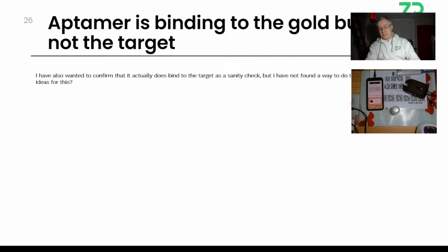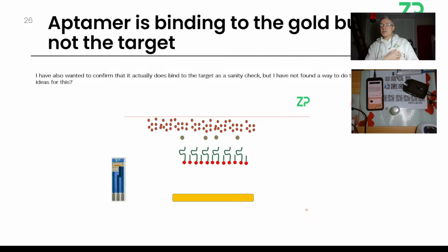It's the same way you're not going to see it by that ferricyanide. At least with the ferricyanide experiment, you could try it. But I'm not holding up a lot of hope. I suppose it's a tricky one. It's almost like if there's somebody in the lab doing another aptamer assay, and you're not able to follow the aptamer assay out of the literature, it could be the literature that's actually not reporting 100%.